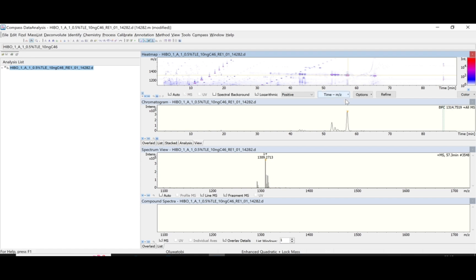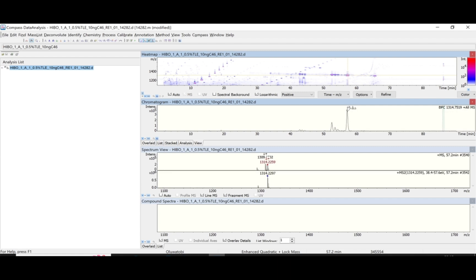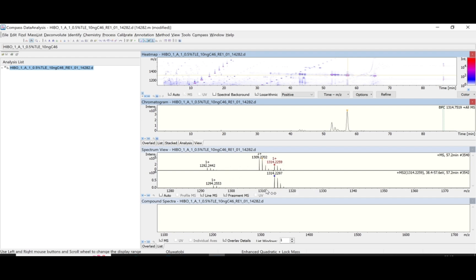I have a peak here, so I click at the tip of the peak to see the masses. What this is showing me is that for this compound I can identify here, it has masses of 1292.2442, 1309.2702, and 1314.2259.